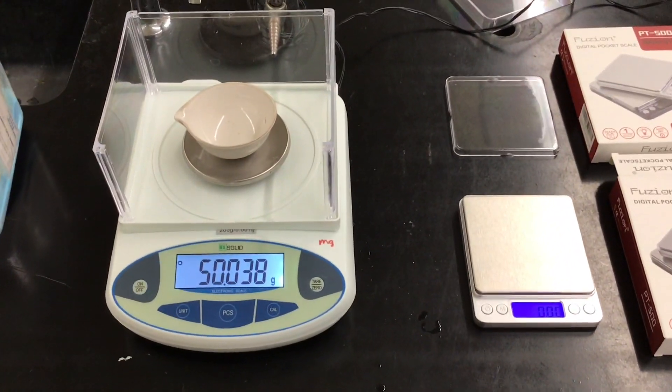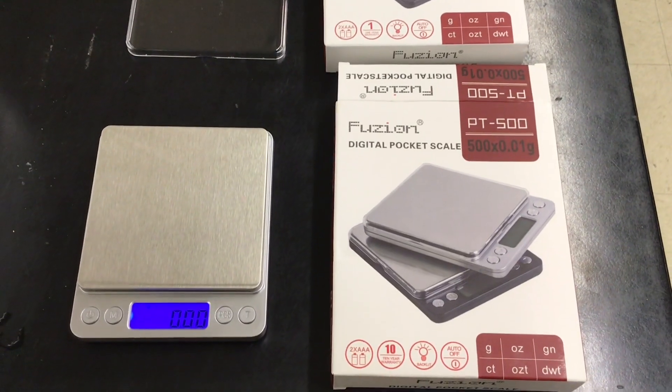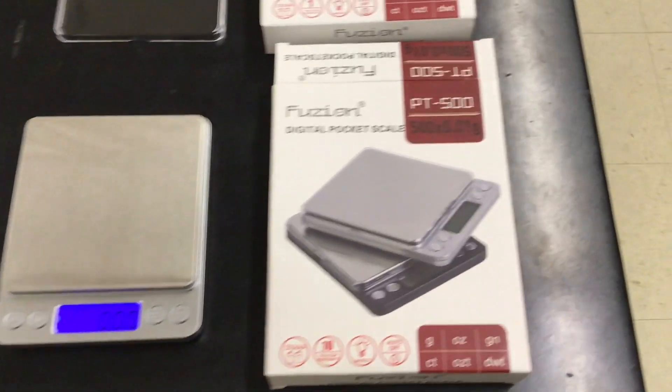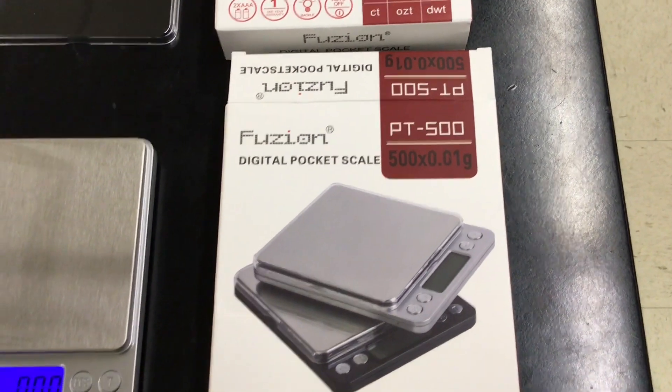Today we are evaluating some balances. I purchased these fusion digital pocket scales from Amazon for about $15 each. It appears to be a centigram balance with a max of 500 grams, which should handle most of our needs.